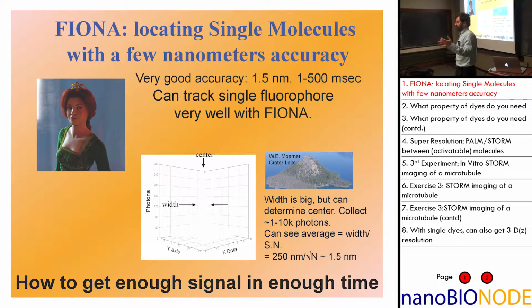Although after 100,000 or 1 million photons, it'll die. So essentially, any molecule will put them out fast enough. What ultimately limits it is its photostability.